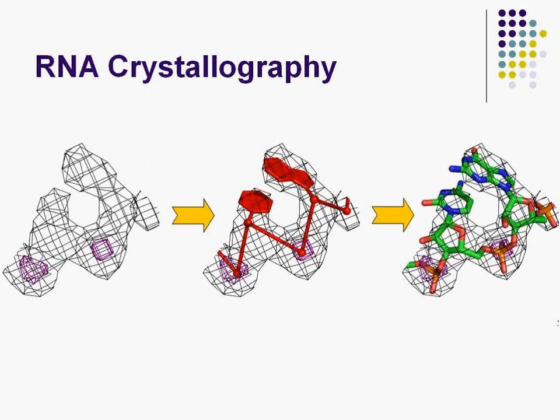So if we go to the slide that I showed before, this figure here looks pretty much like the pseudotorsions that I was just talking about. This figure here looks pretty much like the RNA backbone conformers. So the main thing with RCrane is it helps you place phosphates and bases, and then uses pseudotorsion information and the p-perp distance information to predict and build the appropriate conformer.